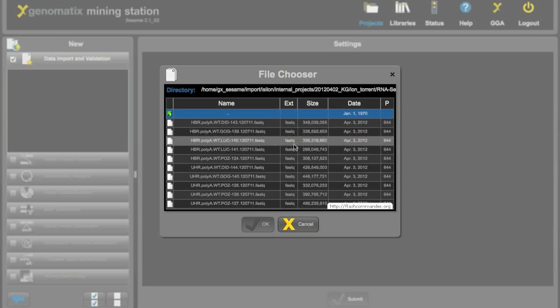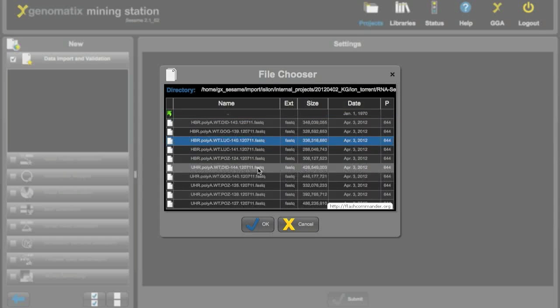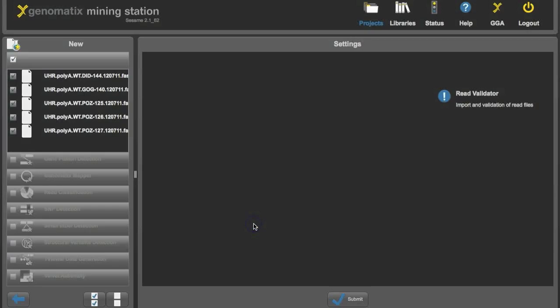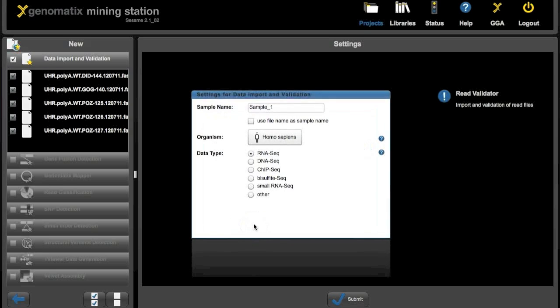To select a file either click on the name, or you can also use the shift key to select a group of files, like all these for the universal human reference now. And then clicking on ok will bring up this window.